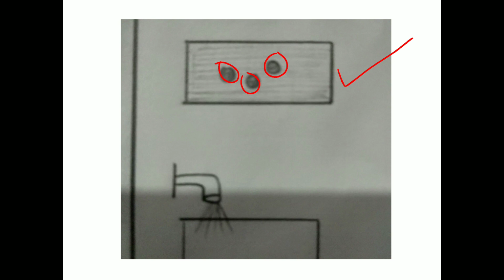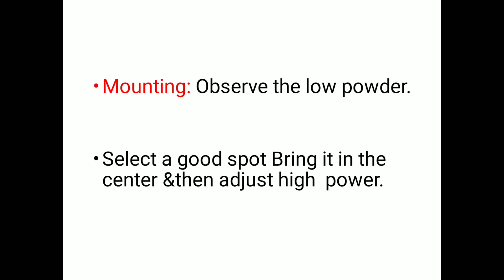After that we wash the slide with water and wipe the surface to clean the slide. After washing, we mount the slide under the microscope and observe it.